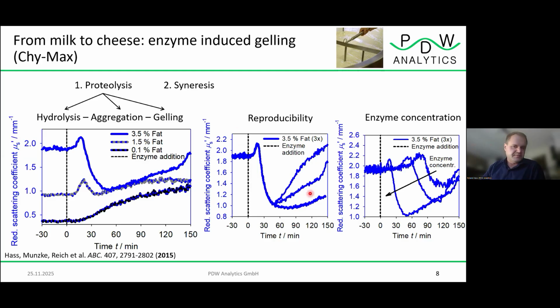But this can be nicely followed inline. For example, another easy experiment is, of course, playing around with the enzyme concentration. And if you increase the enzyme concentration, you see an influence on the dynamics in the process, so speed of process, if you like.